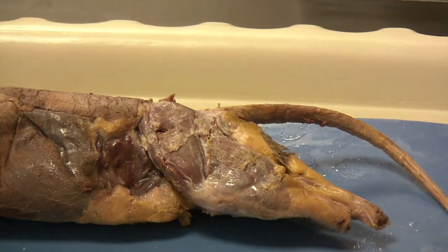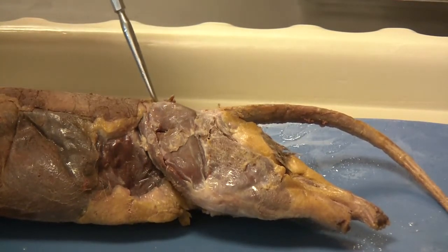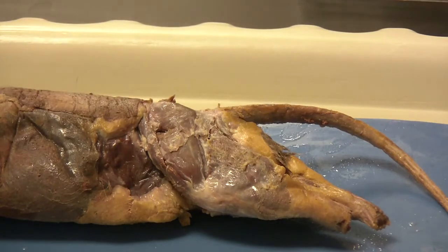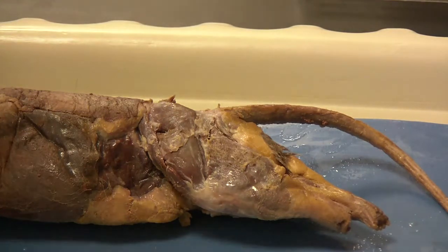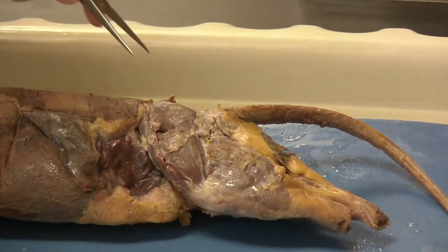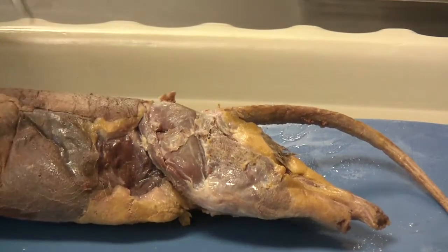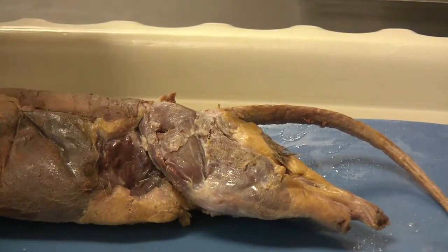You will identify the gluteus maximus as this muscle right here. It will be a circular shaped muscle towards the tail of the animal. The problem with cutting through the gluteus maximus is that there are layers underneath we'd like to preserve, so we need to be cautious when cutting through. First we will pinch with our tweezers and pull upward, and then we will make small shallow snips with the scissors to get through to the next layer.